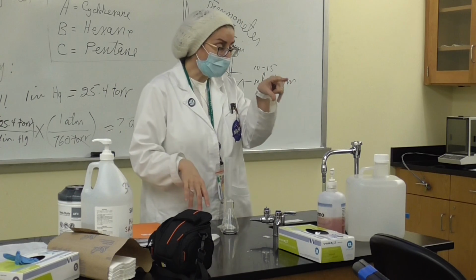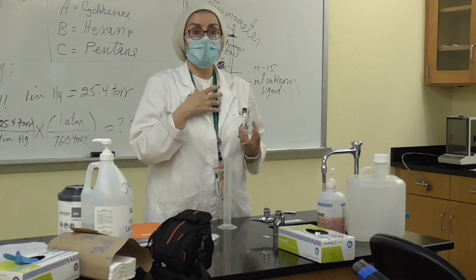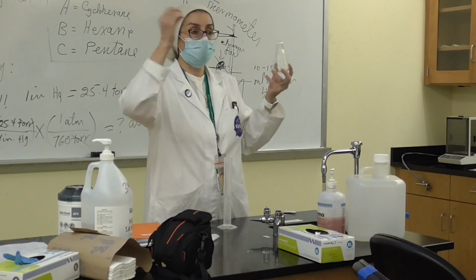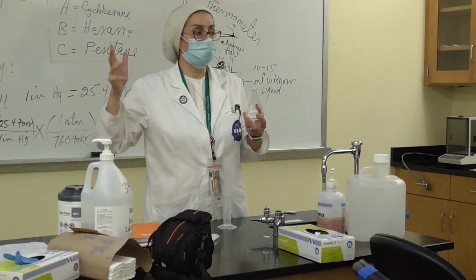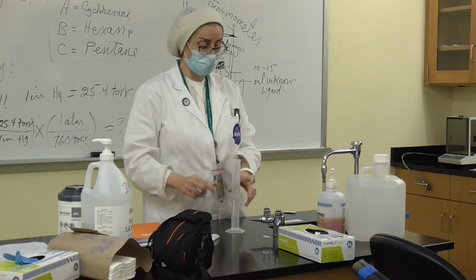After you finish the second trial, you want to measure because it's asking you what is the volume of your sample. That's the volume of your sample, which is the volume of the Erlenmeyer flask. Because the gas will occupy its own container. Got it? So we're going to fill it with water and measure it with the cylinder. That's it. All right, that's it.